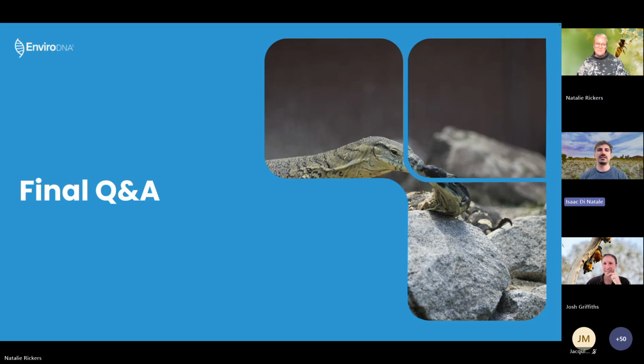Yeah, I guess it depends on where that insect is, and where you tie in what you know about its ecology. If it's positive on the leaf, it's obviously contacted the leaf, that's where we've got that DNA from. In terms of whether it's in the soil or not, soil sampling can be a little bit tricky, especially with something as small as an insect. If it's just landing on the soil, you're probably unlikely to recover enough DNA from something small to give you a positive hit, whereas it's probably spent a lot more time on that leaf at the point at which you're detecting it.